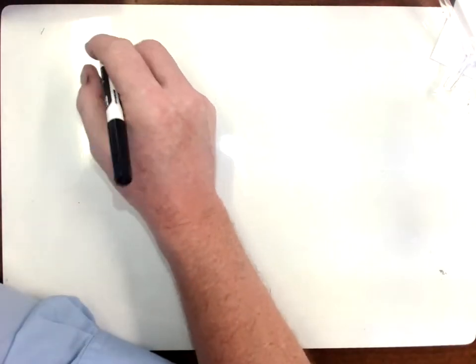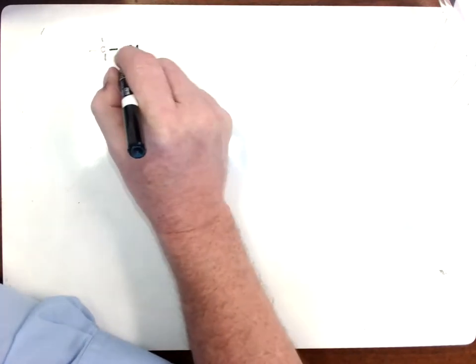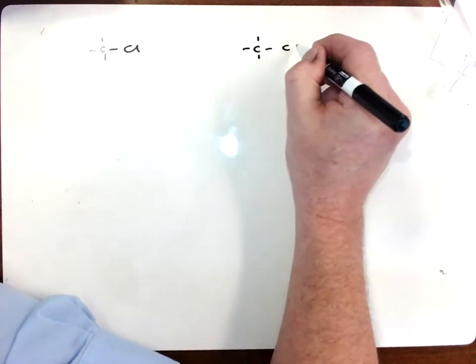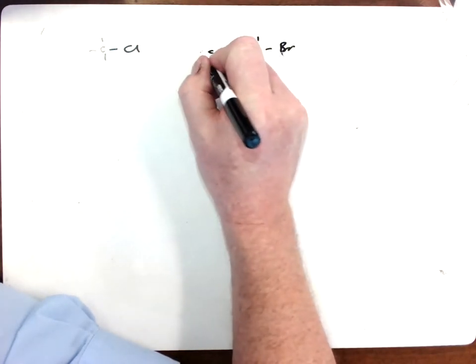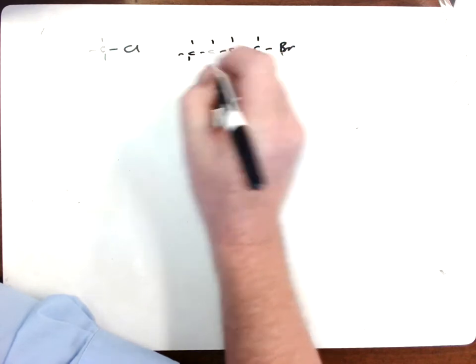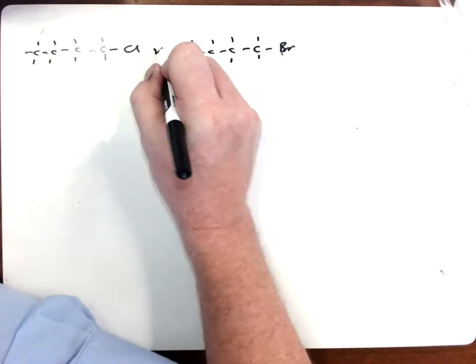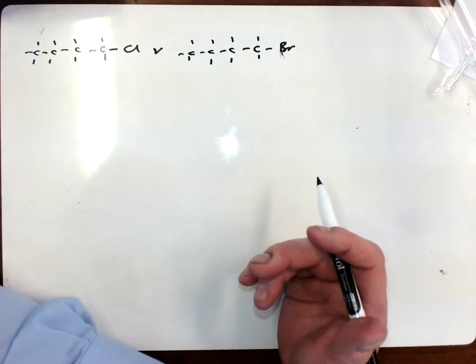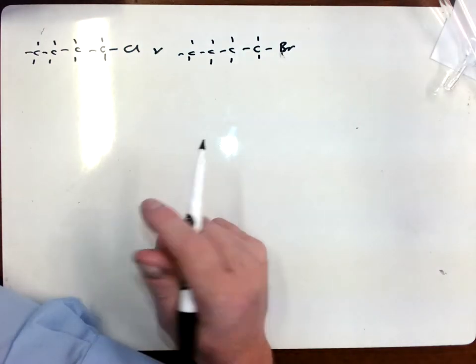Okay, we're going to look at the second practical then, which is how do we follow the rate of hydrolysis, to illustrate the strength of a carbon-halogen bond. So we're going to look at the carbon-chlorine versus the carbon-bromine bond. And we'll look at, let's say, 1-bromobutane versus 1-chlorobutane. Now, how do we actually follow this and gain observations from an experiment to see which of these two bonds is the strongest or the weakest?